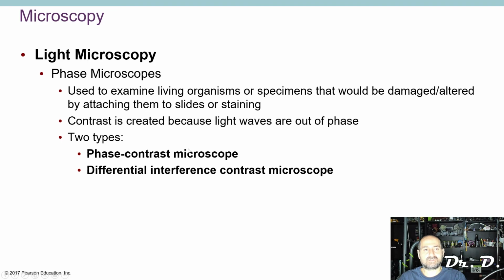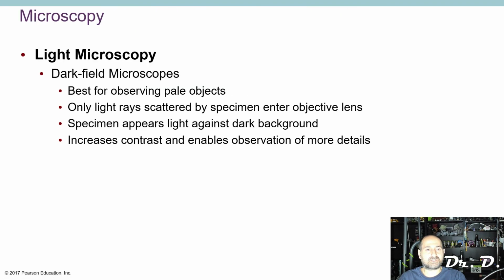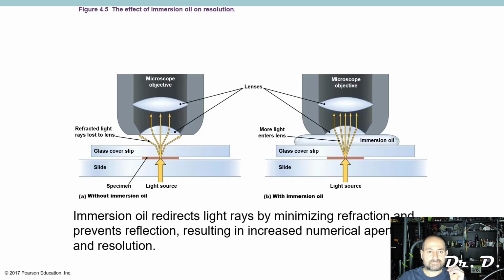And how does this work? Why does this work? I wonder if I have an image here. I may not, but what I want you to know is the way dark field microscopy works is that when you switch it to this type of condenser setting, the condenser makes all of the light escape the objective. Let me show you. You see how the light is going through the specimen into the objective lens? That would be bright field microscopy.